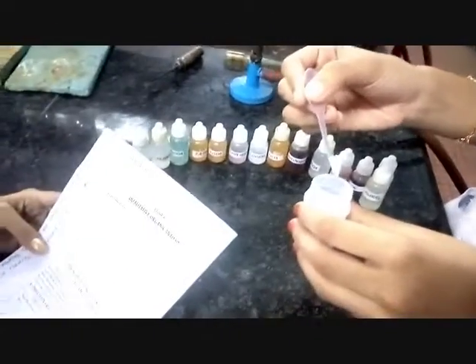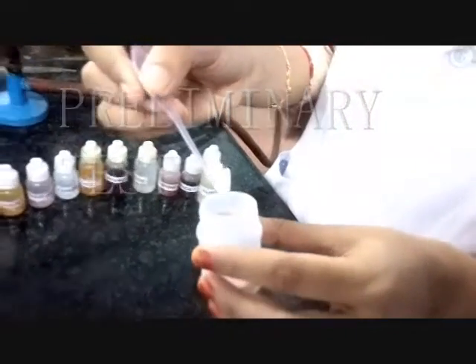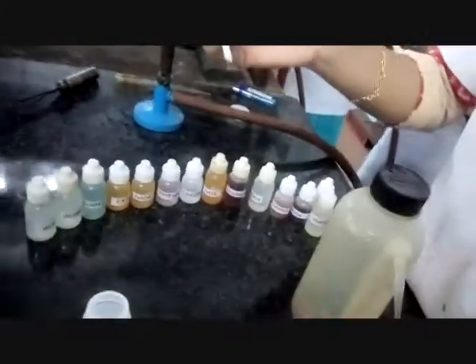Note the color and appearance of the compound. No characteristic color and appearance. Note the odor of the compound. No characteristic odor. Solubility of the substance in cold water.